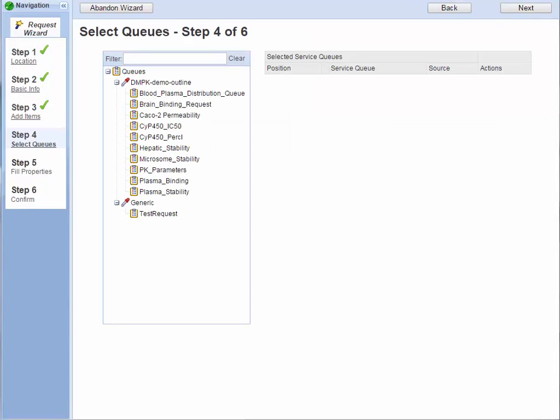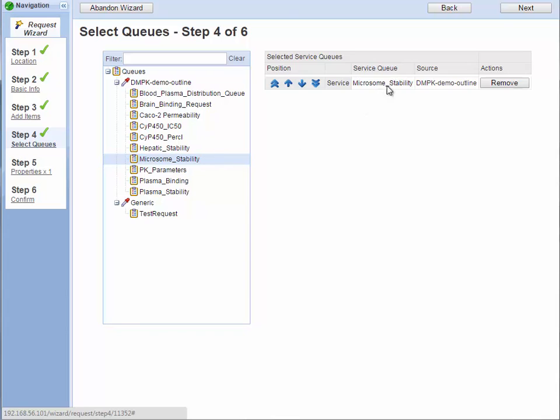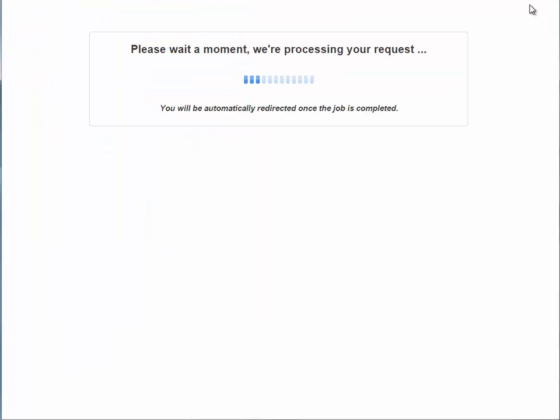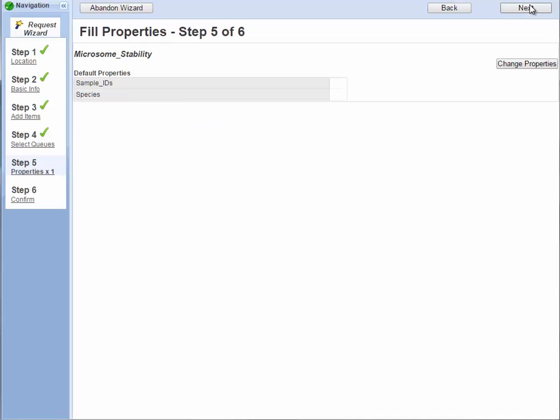I'll be requesting this against the microsome stability assay, but you can request against multiple assays if you wish. Since you can use different species' microsomes, you can set this for each sample.